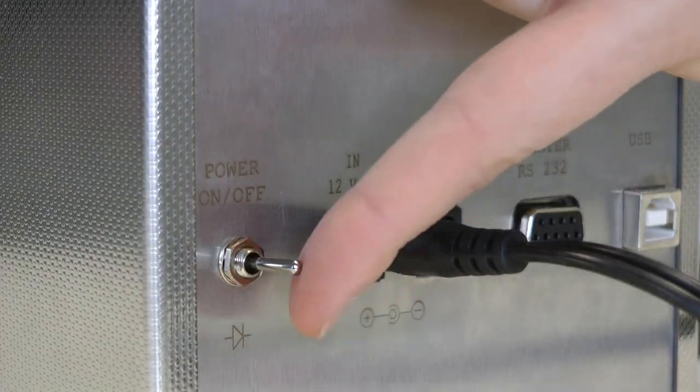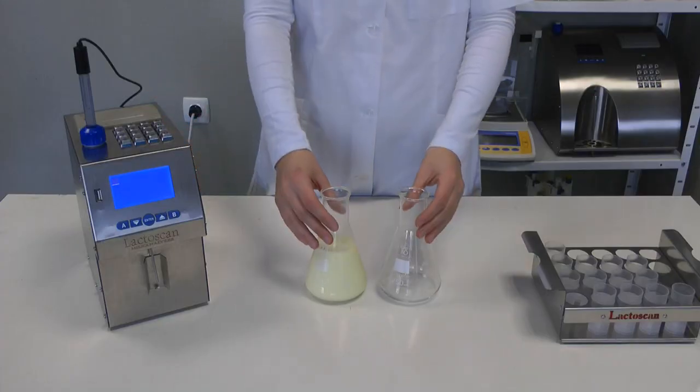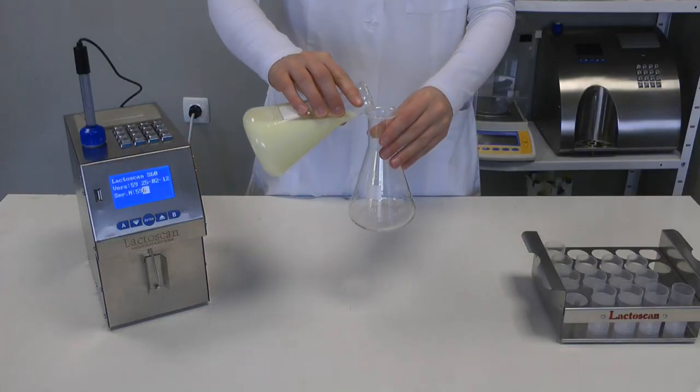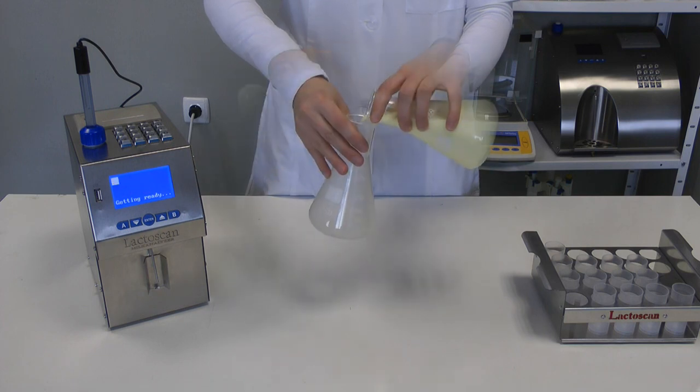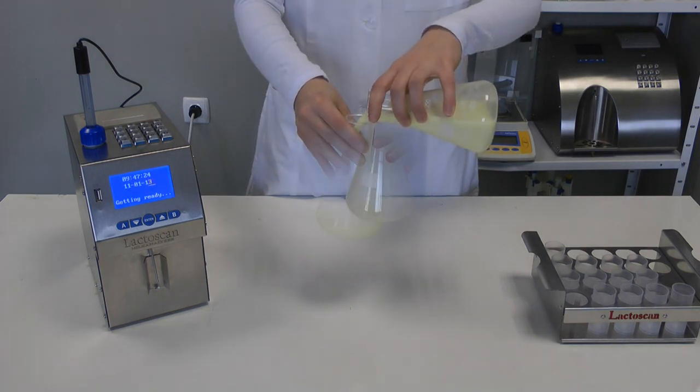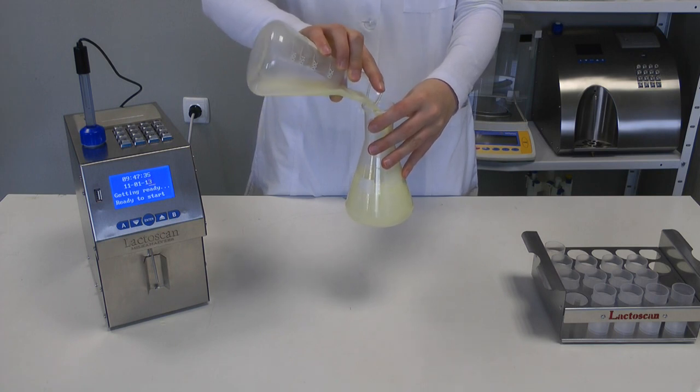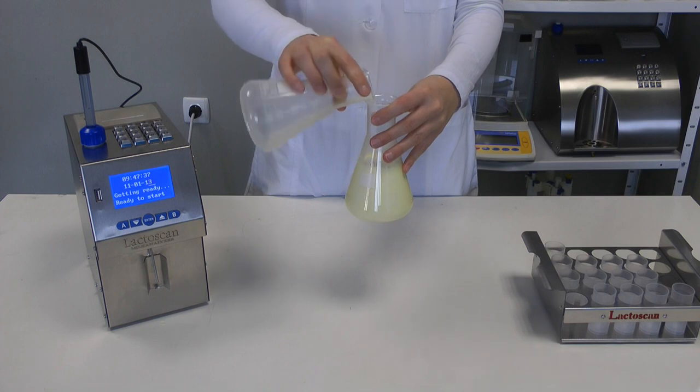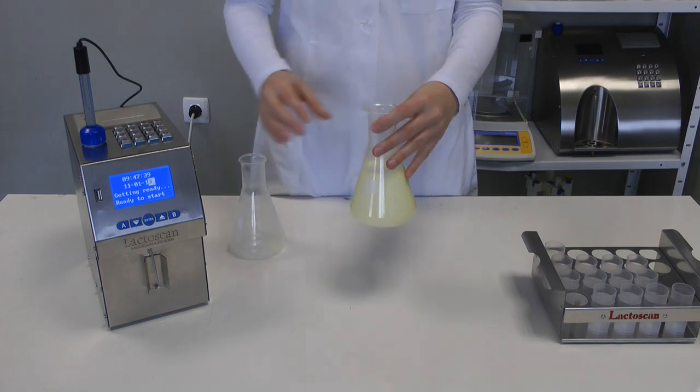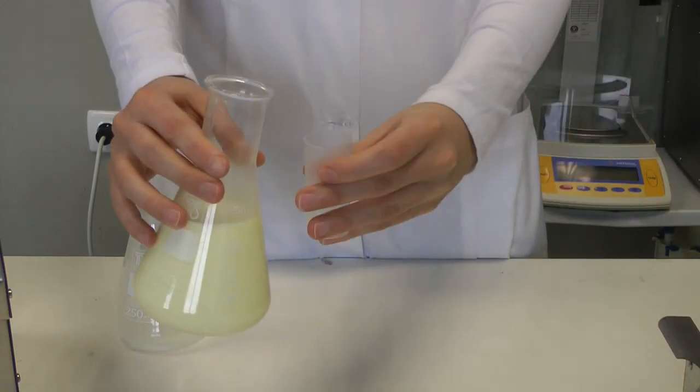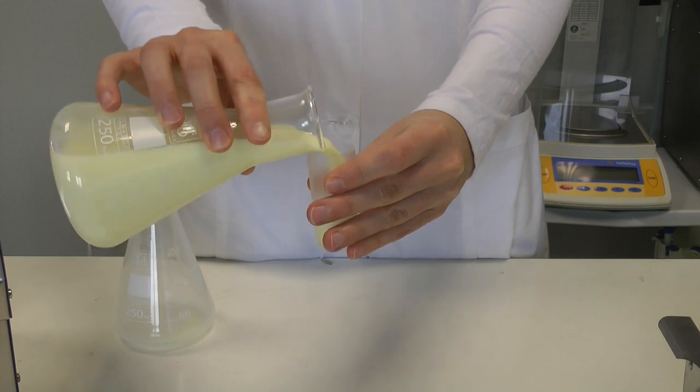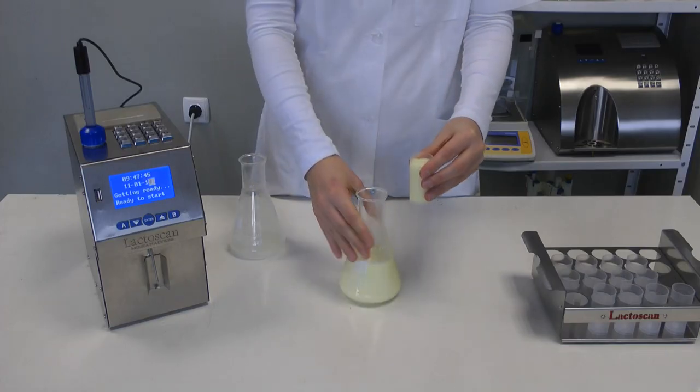Switch on the analyzer. Till the analyzer is prepared for work, the message getting ready is on the display. When it is ready, display shows ready to start. Milk sample must be with temperature at about 25 degrees centigrade. To start measurement, pour the preliminary prepared sample in the sample holder of the analyzer. Put the sample holder in the analyzer.